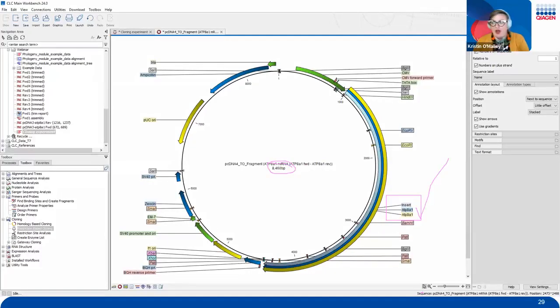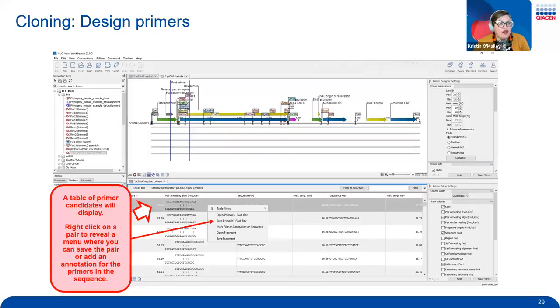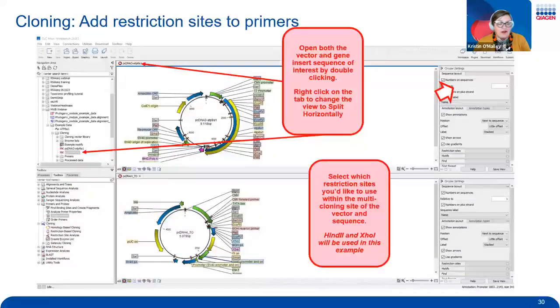8,460 base pair long. So I just want to thank you guys for sticking with us today. We went through a lot of information. So let's just have a quick recap of exactly what we went through in this last little bit of the webinar.